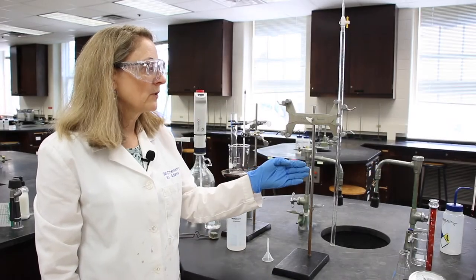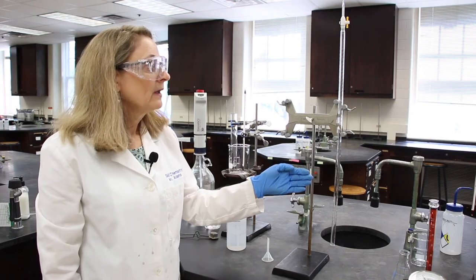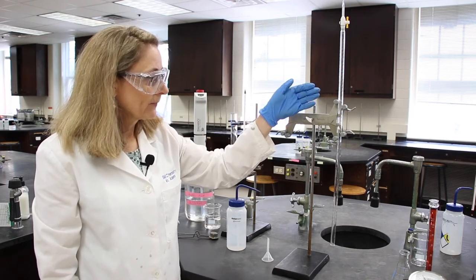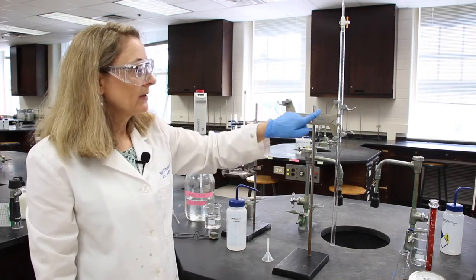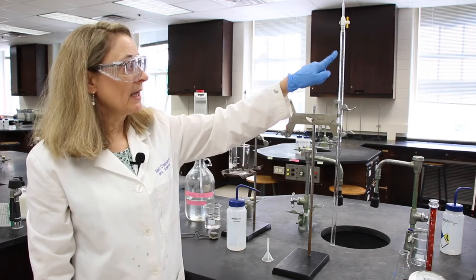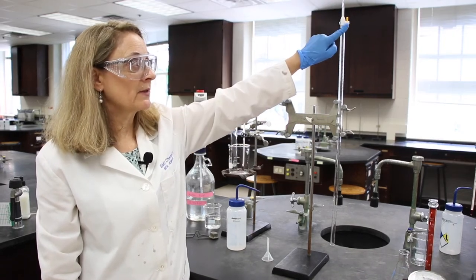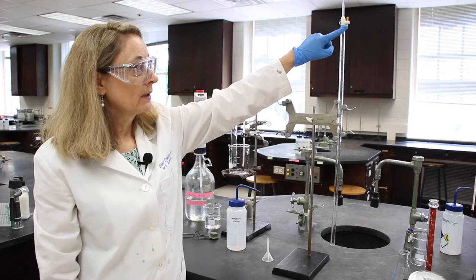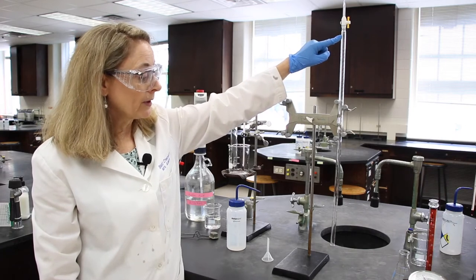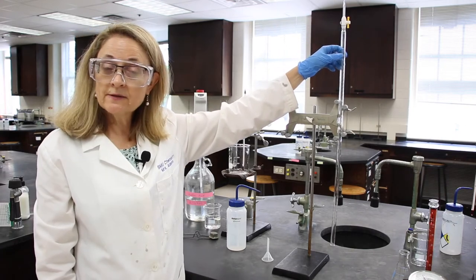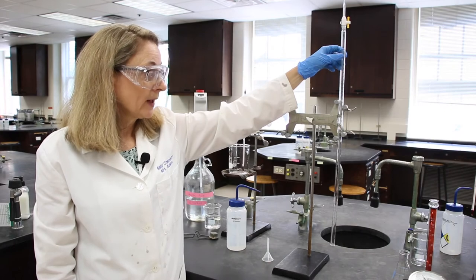The next piece of equipment that we'll be using is a burette. When a burette is in the burette clamp upside down so that the tip is up and the stopcock is open, or it's parallel with the barrel, this signifies a clean burette.